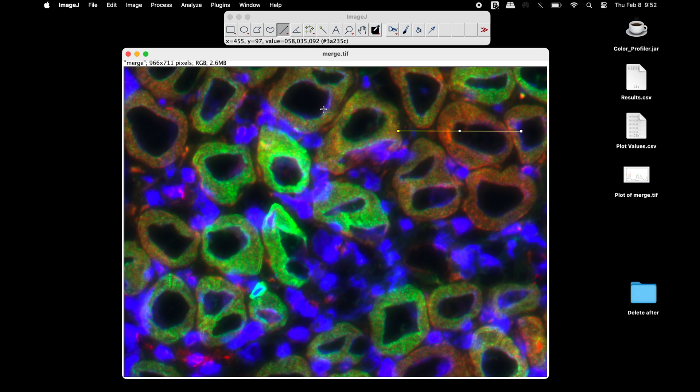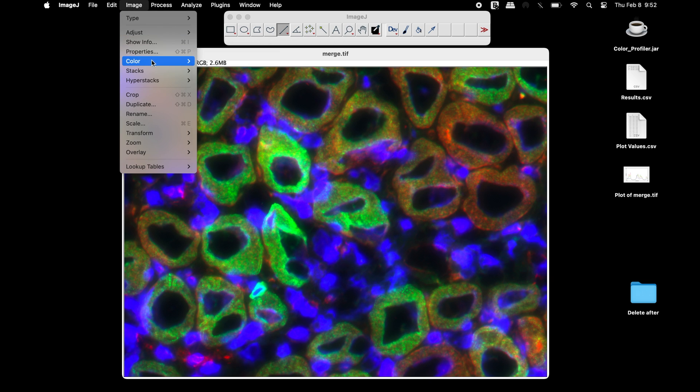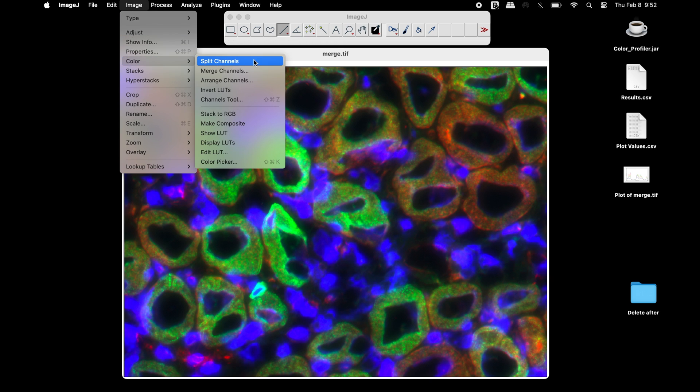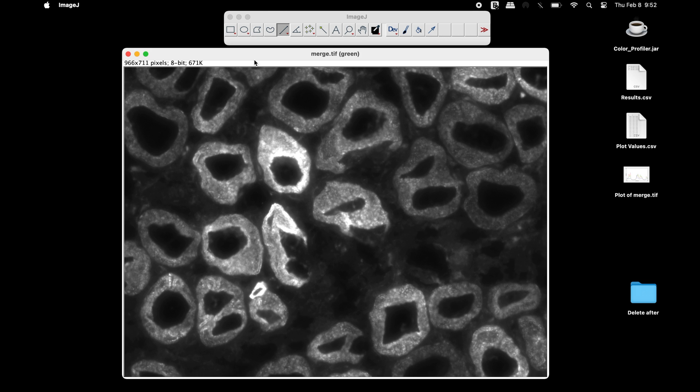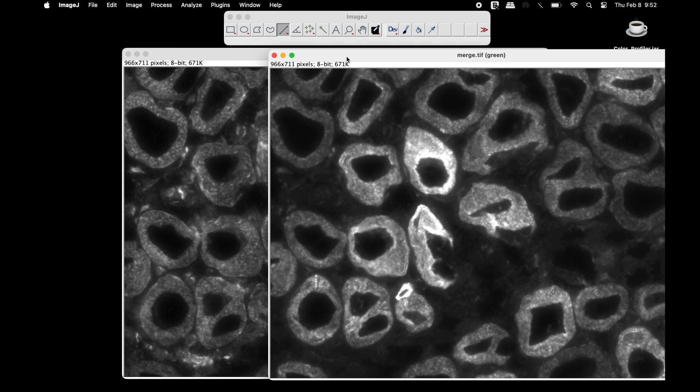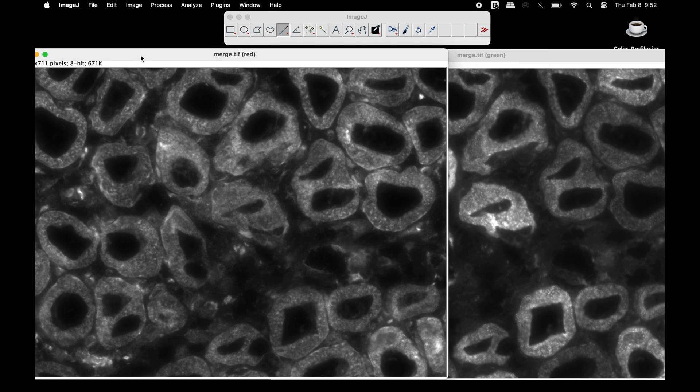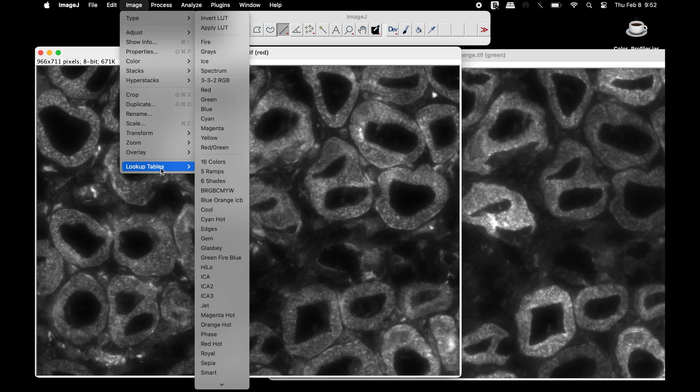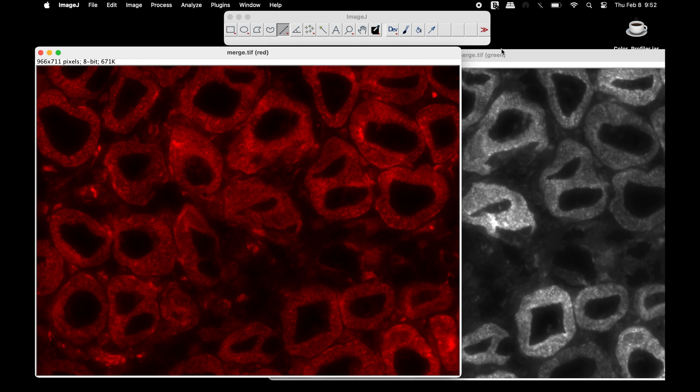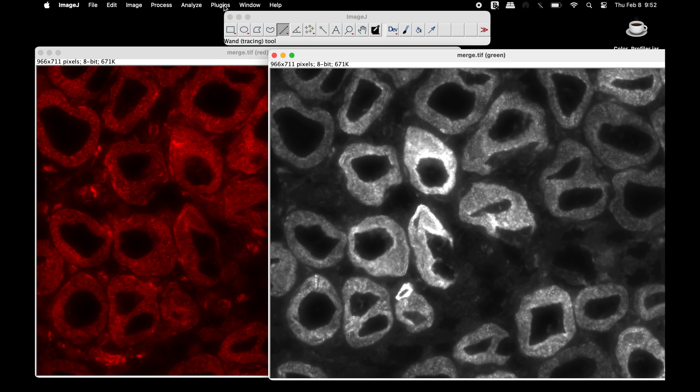To generate the plot profile of only the green and red channels, first split the channels. At this time, retain the green and red channel images. Apply colors to the corresponding channels by using the lookup tables function.